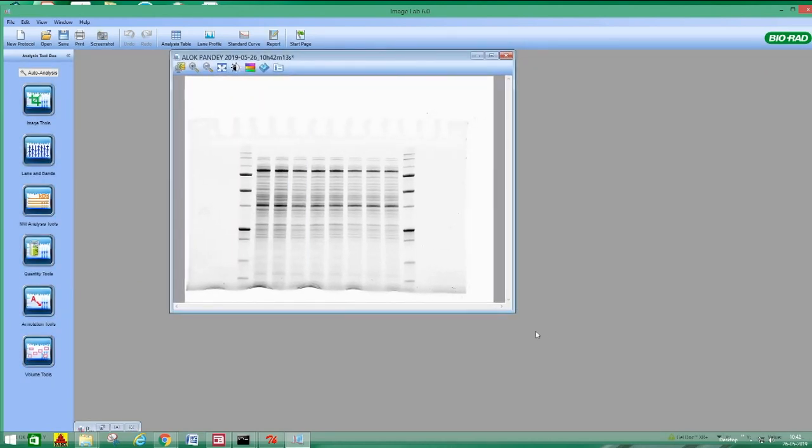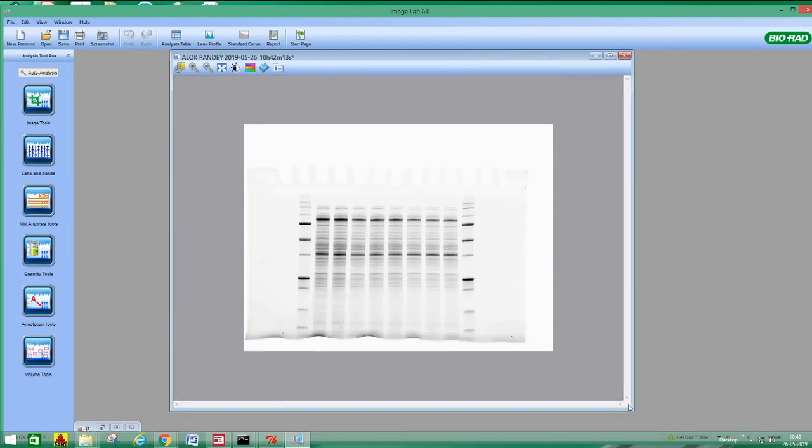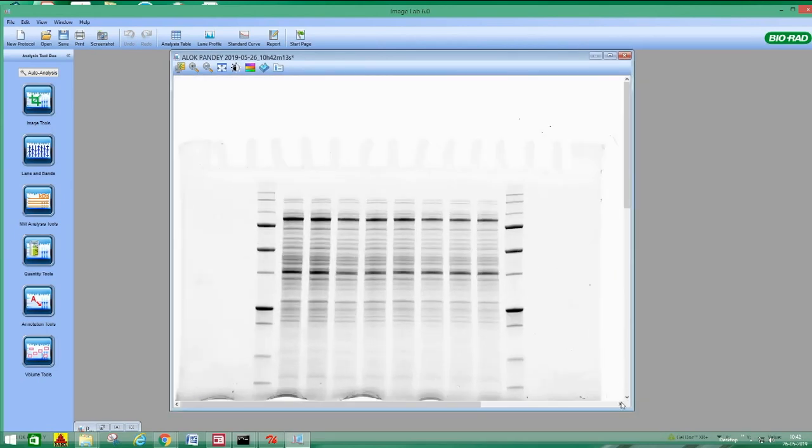So this is our gel image. This is the molecular weight ladder, first row and last lane, and these are the fractions. So we want to analyze how many different bands are there, first component, and what is the intensity of these bands and what is the molecular weight. So I will try to show one by one.